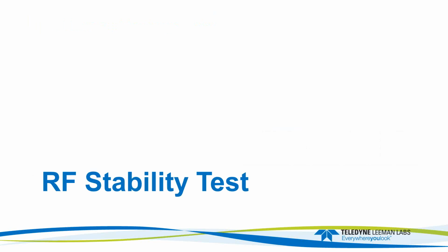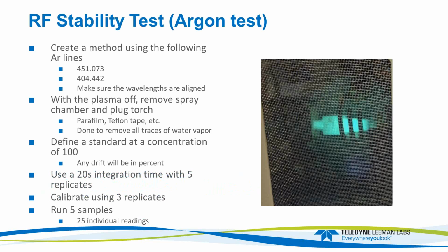Okay. The second test is what we call the RF stability test, or also called an Argon test. And again, that method is resident on the Leeman Labs ICPs. So to do the Argon test, if you don't have it, we create a method and we put those two Argon lines, the 451 and the 404 line. Again, we make sure they're aligned, and on a dual view or axial system, they're in the axial view. On a radial system, you would put those in the radial view.